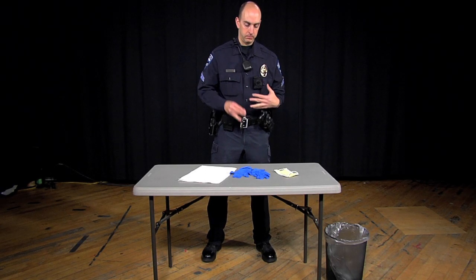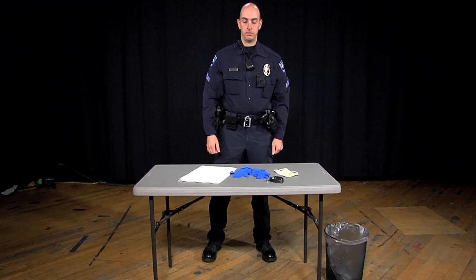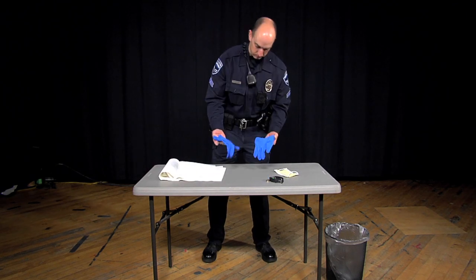Remove any personal items and accessories such as watches and jewelry. Visually inspect the PPE to ensure that there are no rips, tears, or holes.